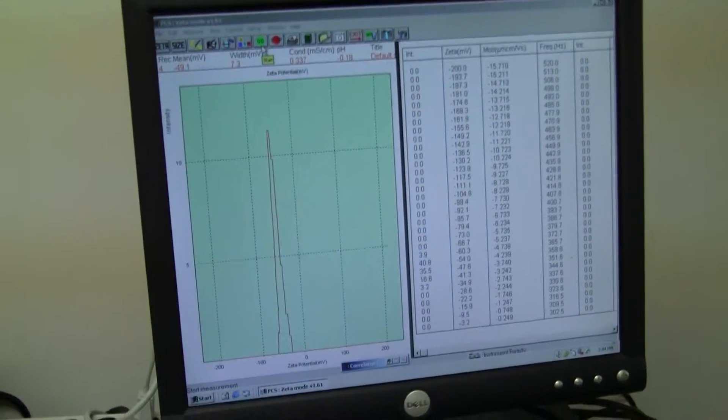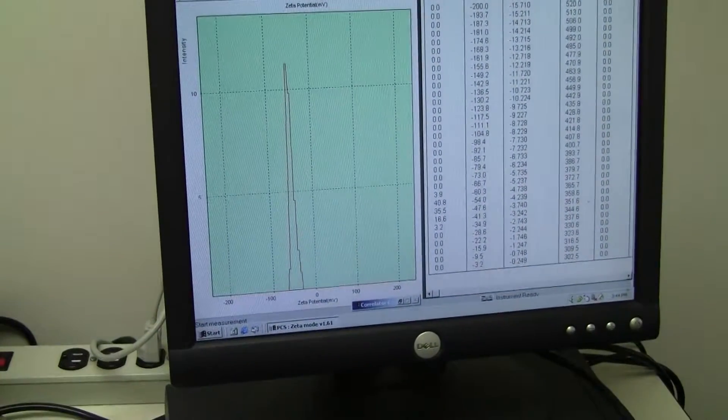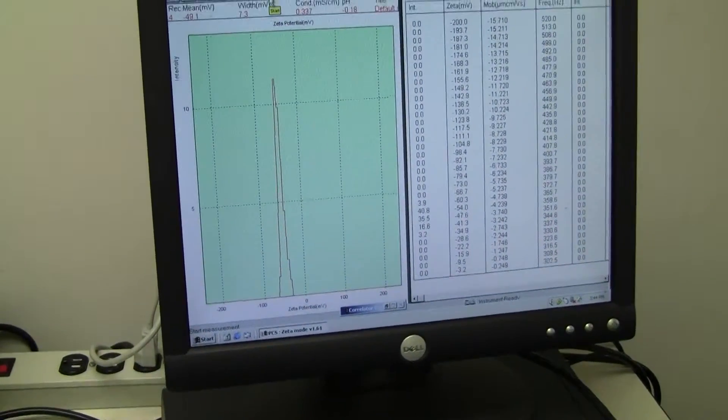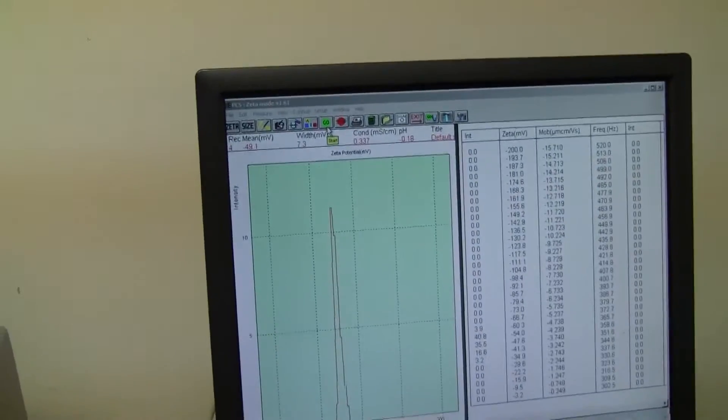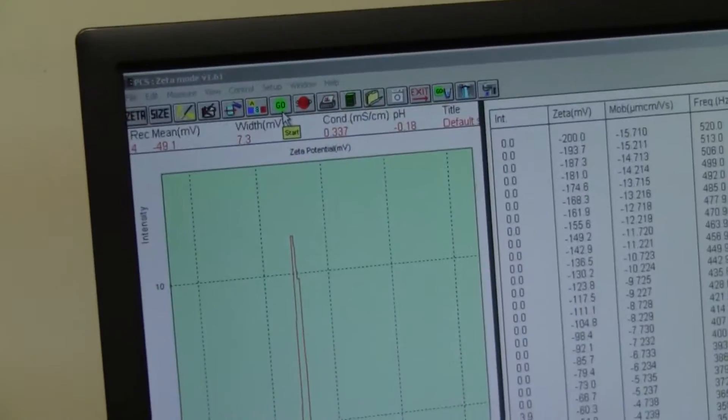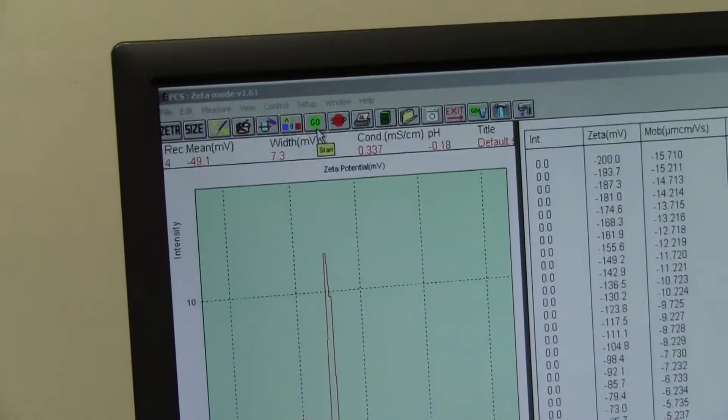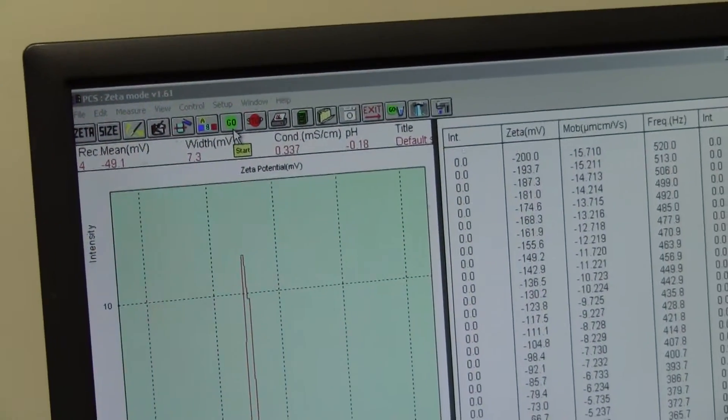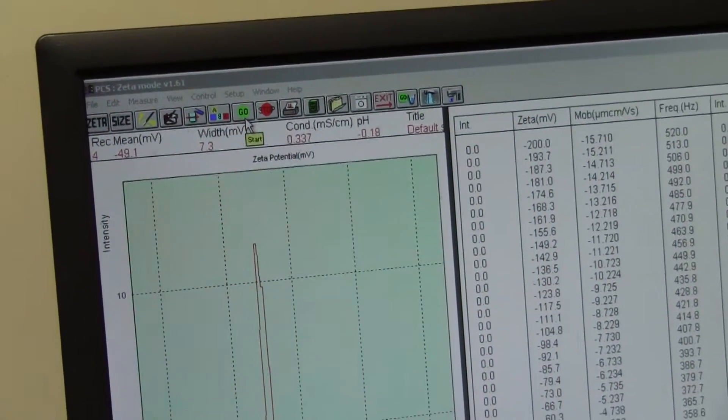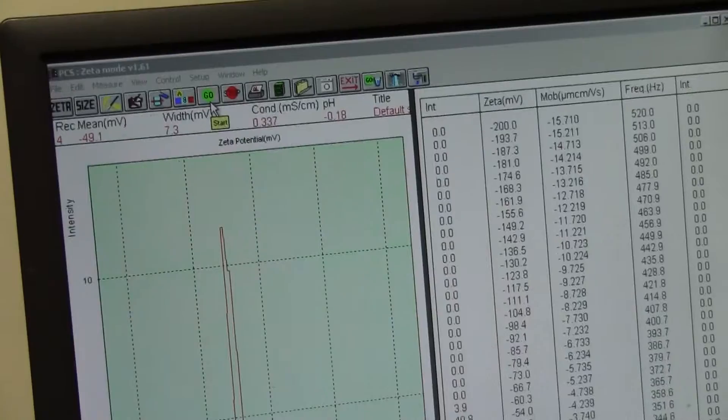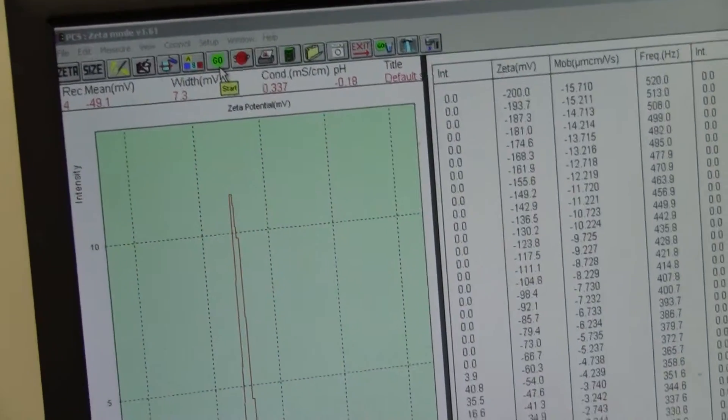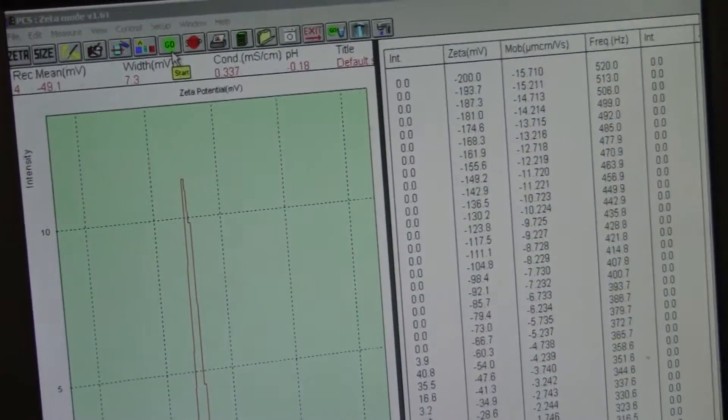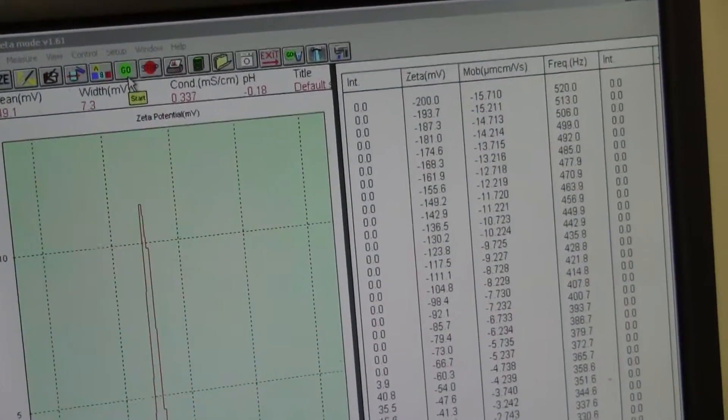And you can see the nice peak range. Minus 49 measurements with 0.33. I believe that corresponds directly with the standard paperwork.